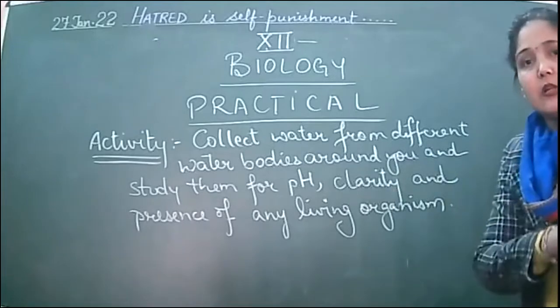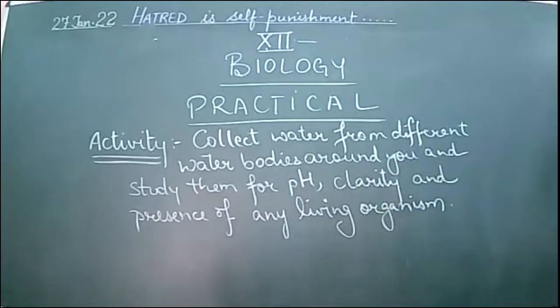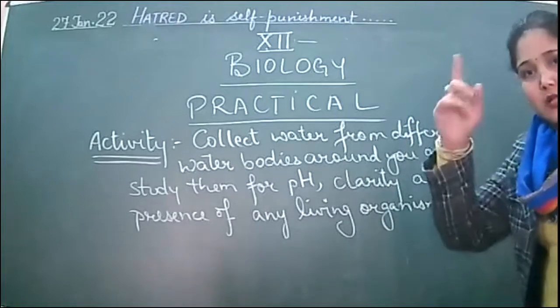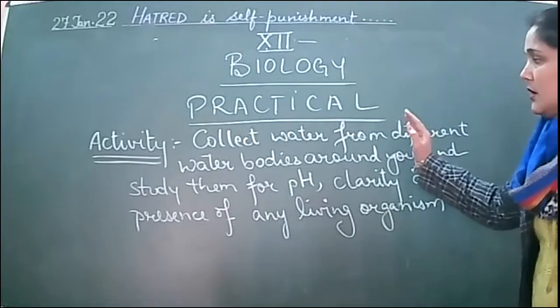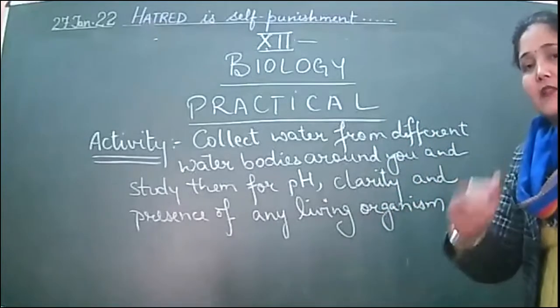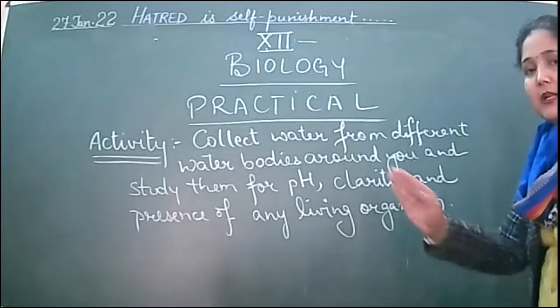And also the water which is there in the school water taps, right? So we do take those water, even the water which is stored, and we have a small little pond up on the terrace of the school also, right? So 2-3 water samples are collected, and we perform this on the exam day. You will also be performing it in the same manner as you will be seeing it in the video.